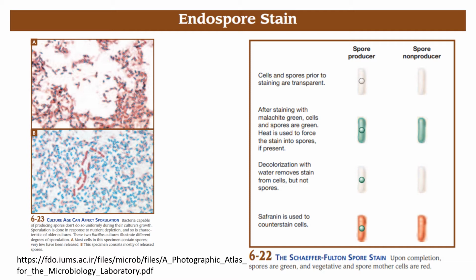So for example, you have Clostridium tetani, Clostridium botulinum, Clostridium perfringens, etc. Okay. Of course, Clostridium tetani is the one that causes tetanus, and Clostridium botulinum is the one that can cause botulism. And another thing, they can make this endospore, and endospore is actually dormant. Okay, and so what happens is the endospore allows bacteria to survive even in harsh environmental conditions.